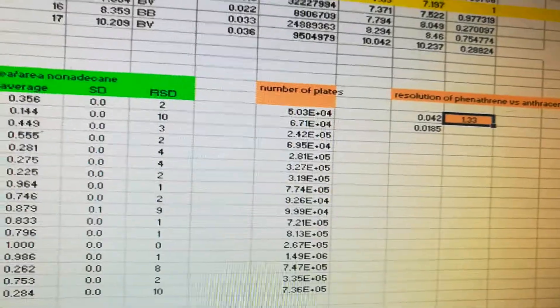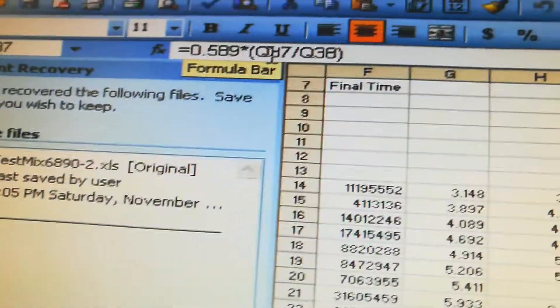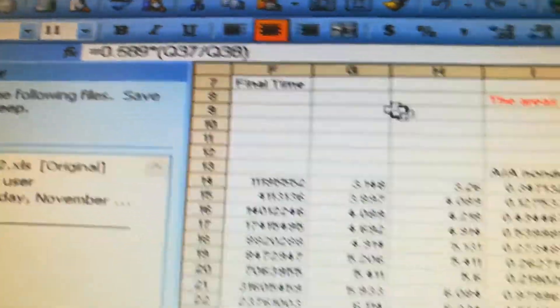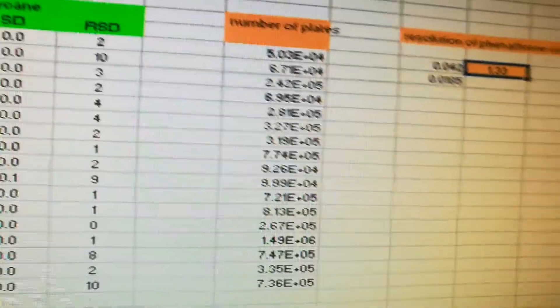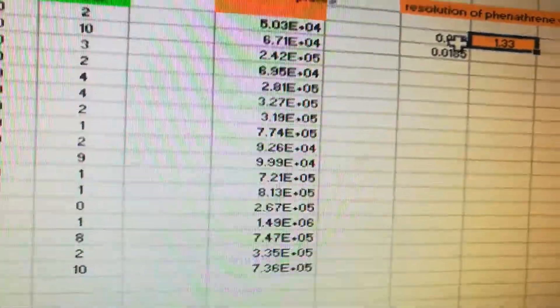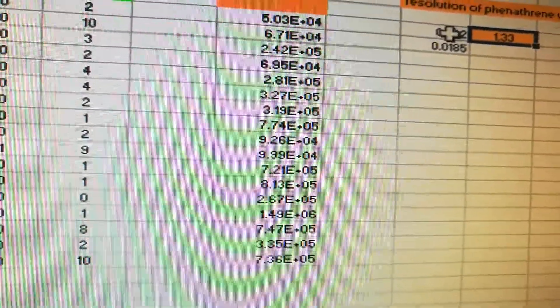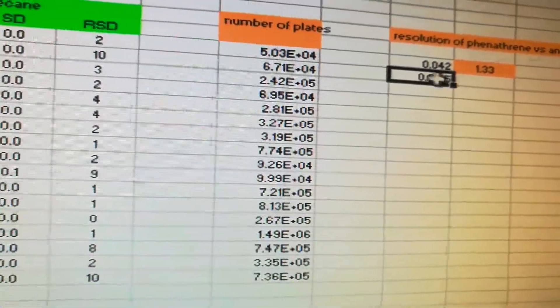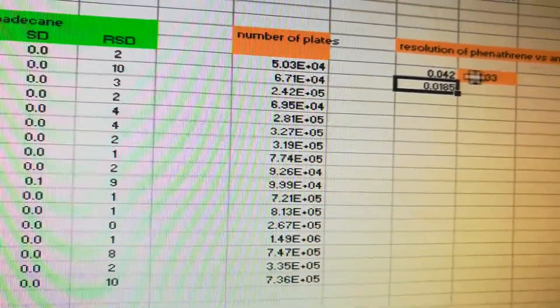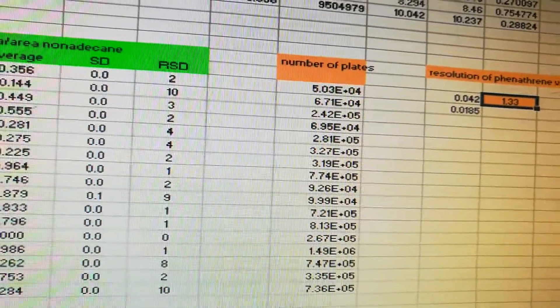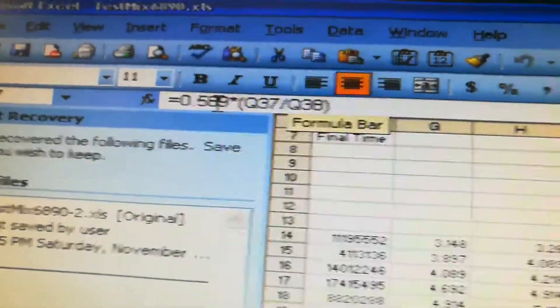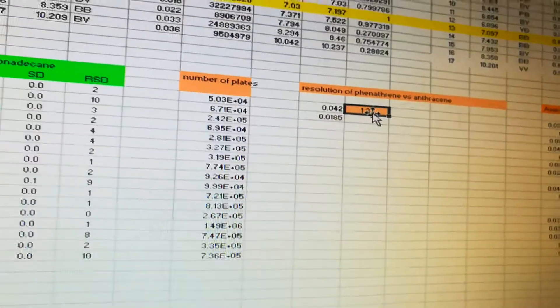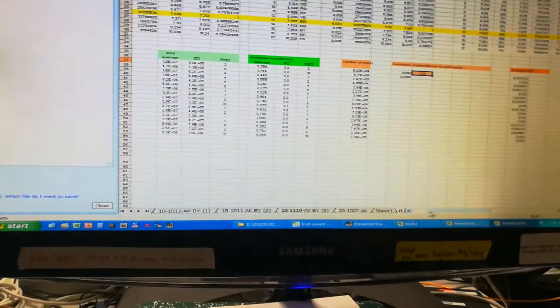To figure out the resolution, use the equation: 0.589 times (Q37 over Q38), where the numerator is the difference between the retention times of those two compounds and the denominator is the average peak width of those two compounds. Take the ratio of those two numbers and multiply by the constant 0.589 — that gives you the resolution of phenanthrene versus anthracene. That's it for the data processing for this step.